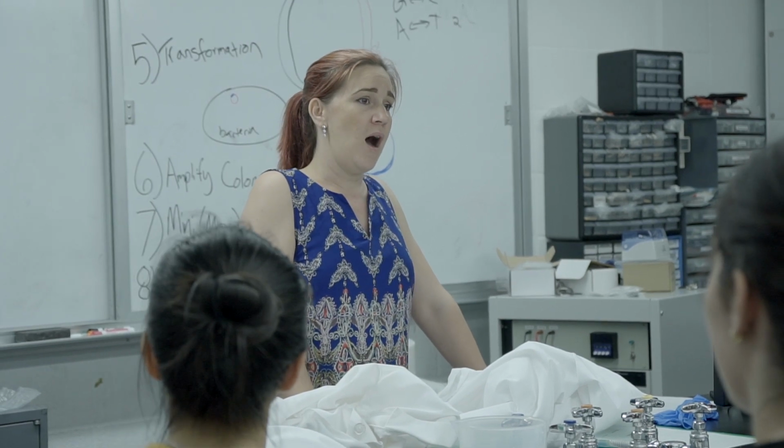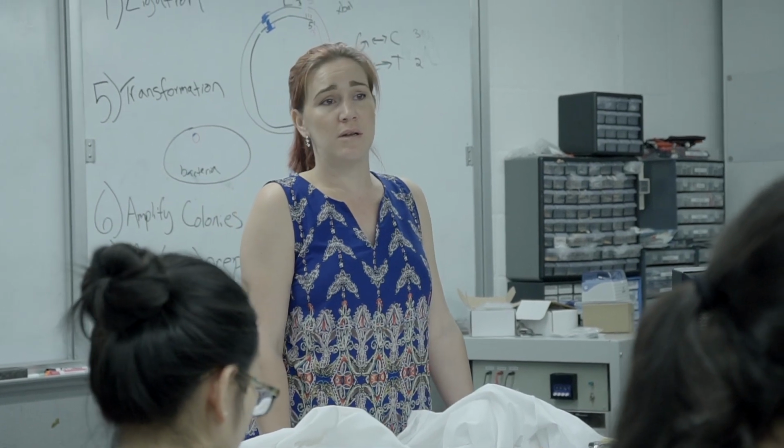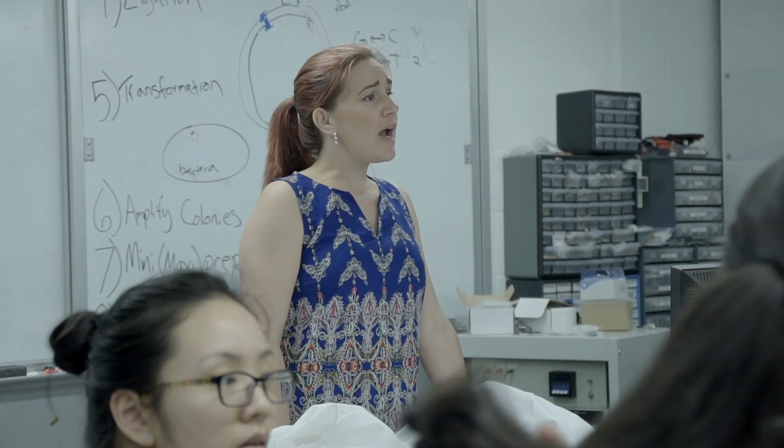I think I saw Mike looking at it. Are gels close? 3 minutes. Perfect. So are there any questions about these ideas or these concepts we went over today?